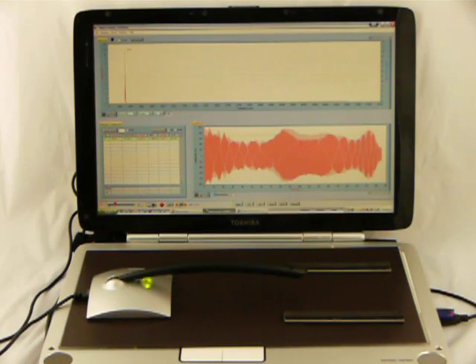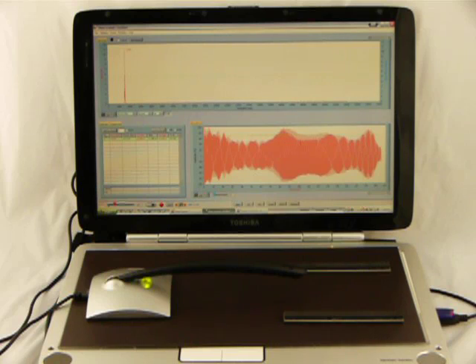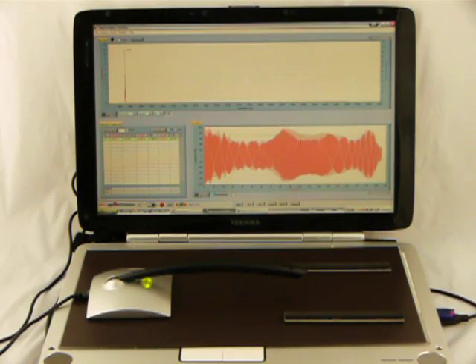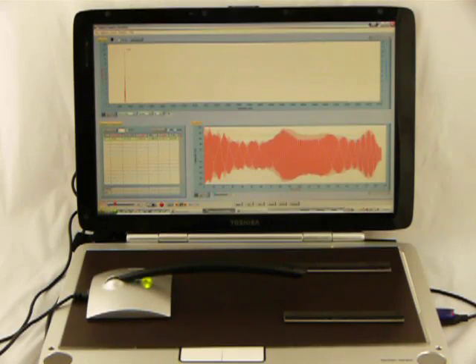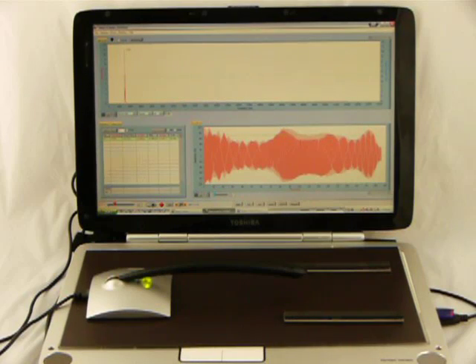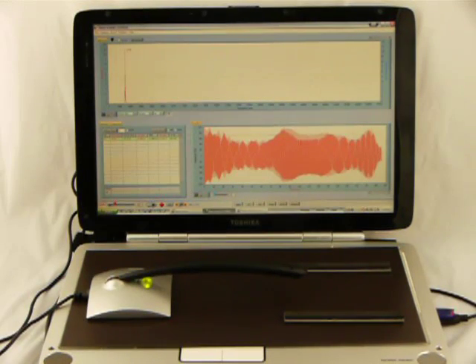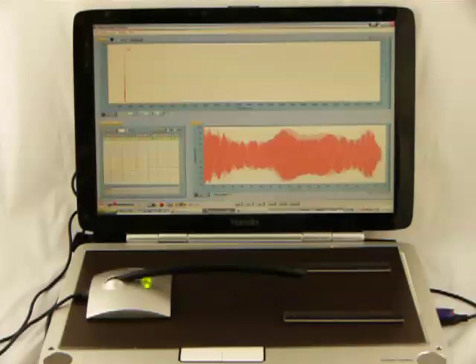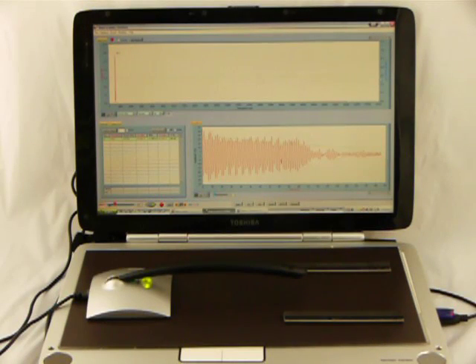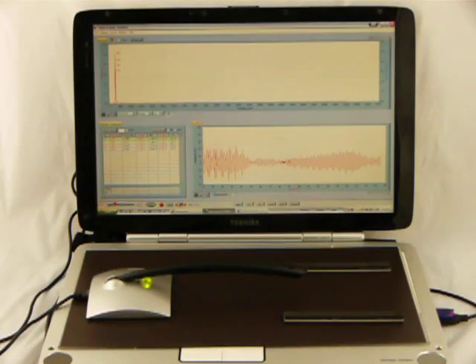The HASP key and the microphone should be plugged in before launching BuzzoSonic. That's very important. So before launching BuzzoSonic, plug in the microphone, plug in the HASP key, and then launch BuzzoSonic. Now normally when BuzzoSonic opens it's all set to go. I turned off a little button here which is described in the instructions. It's called the analyze button.